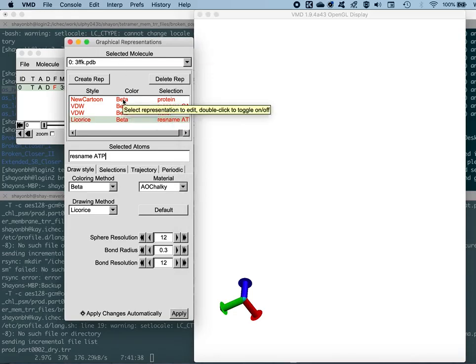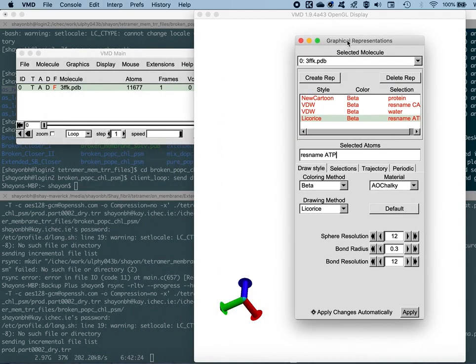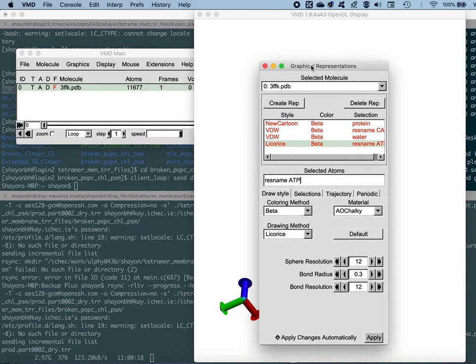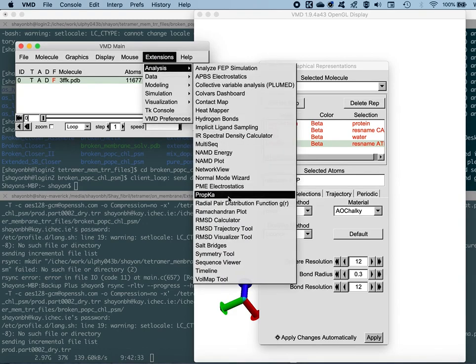And the next thing that we'll do is we'll try another method to show the beta values, that is the fluctuating regions or the atoms or the residues in the complex. So another way to do it is just go to extension and then you go to analysis and then you load the sequence viewer. So this is from the perspective of the amino acid sequences that are there, or for that matter, the metal ions and the water molecules that lie in the sequence.